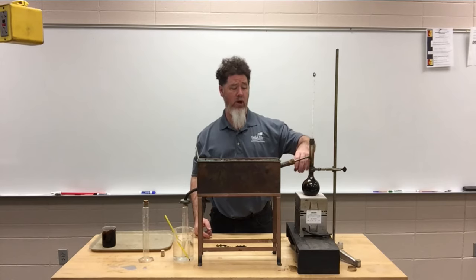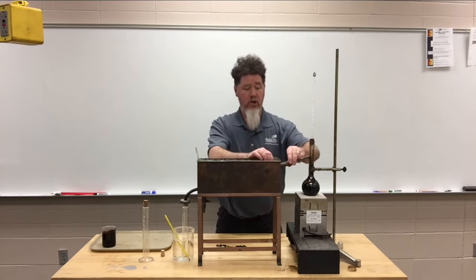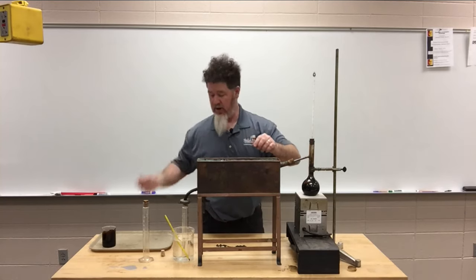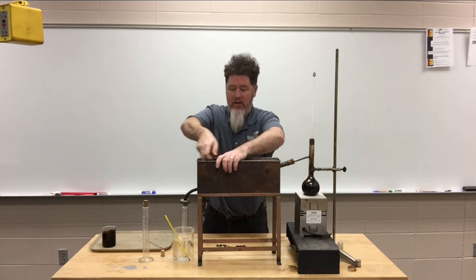As it starts boiling, the vapors are going to come up. The vapors can't come out because it has a cork, and the vapors are going to come through this tube. It's going to go through my condenser. Now, my condenser has a thermometer in there so I can see what the temperature of the condenser is, but it's full of ice and water, so I can get some of my ice out so you can see the ice on there.